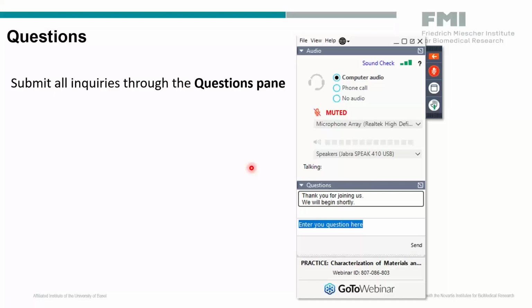You have to think in advance what resolution you would like to acquire, and adapt the tile size according to that question. And maybe increasing the size of the tile would be a way to speed up the acquisition.